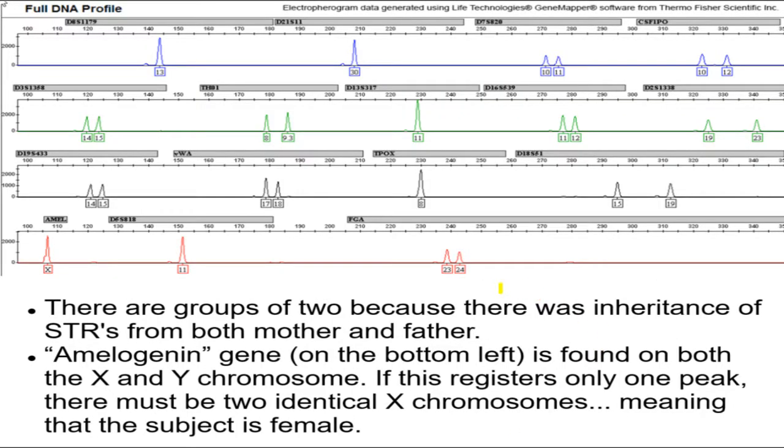So here's an example of a DNA profile that was obtained. We're going to say that here's the electrophoresis column, and this would be the time 100, let's say 100 seconds. This is 145 or so seconds. So we see this, whatever it is, the D whatever.